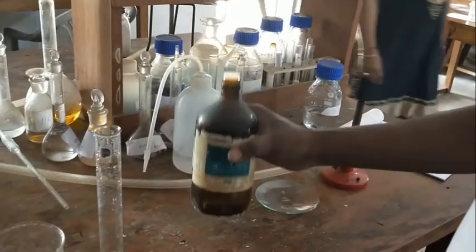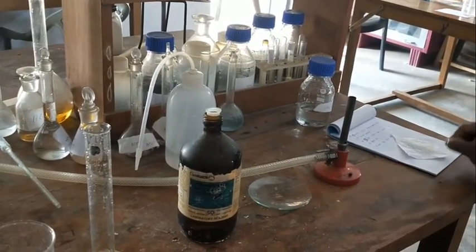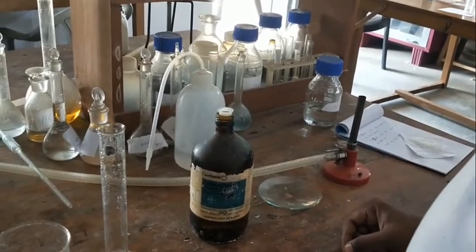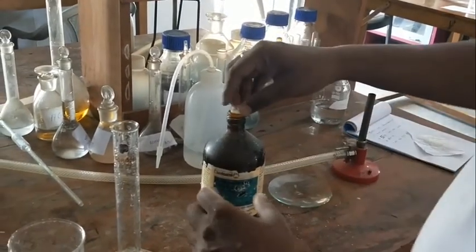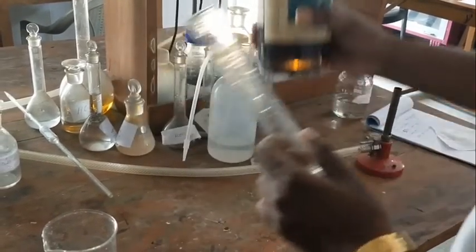This is formaldehyde. For the preparation of urea formaldehyde resin, we will take both urea and formaldehyde. First I measure about 10 ml of formaldehyde.